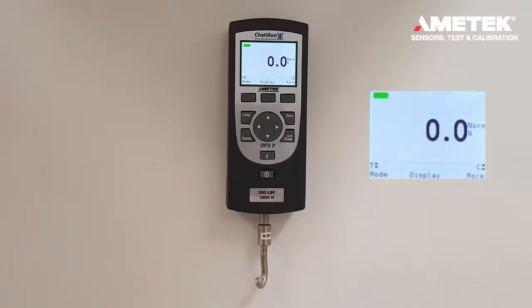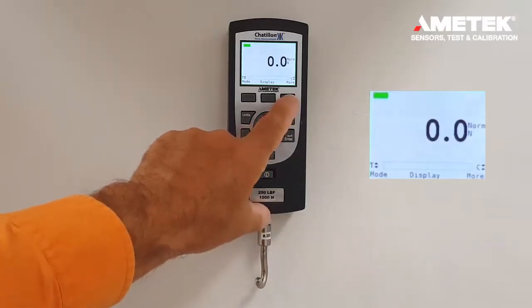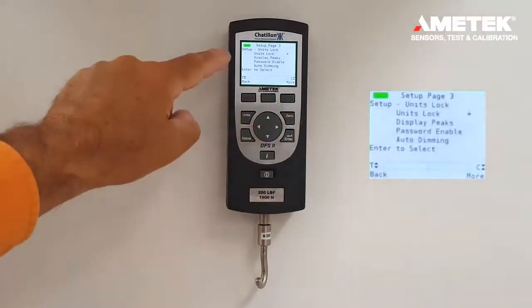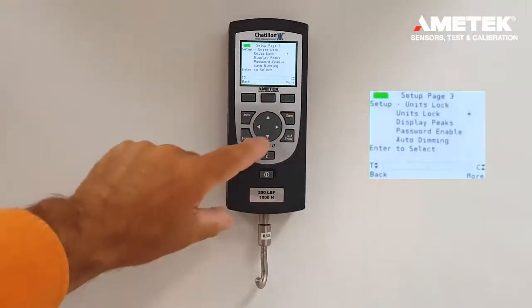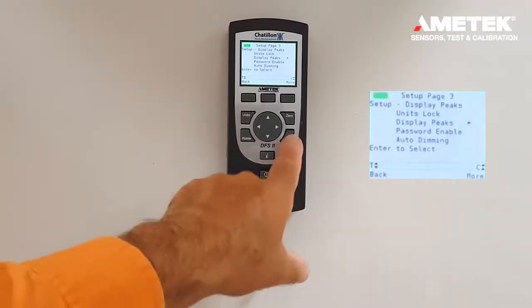In order to display the peaks at the same time the live loads are being recorded, you press the F3 button, more, four times, until you see display peaks. Then, using the down arrow, you would press the display peaks and press enter.